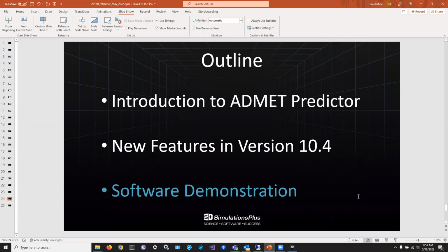Yeah, that's a good question. So, we only introduced the API in the last release of ADMET Predictor 10.3. It was only about 8 months ago, I think. Prior to that, there was no reaching out to any external server. So you would install Predictor locally at your company, and all the predictions are performed locally. Nothing ever leaves your company or your machine, other than to check out a license. That's the one exception, that you would reach out to some Flexera license server that would check out a license. Other than that, the data never left the machine.